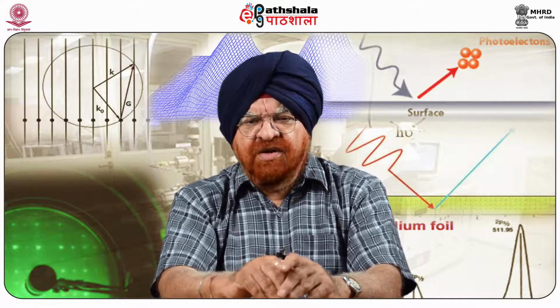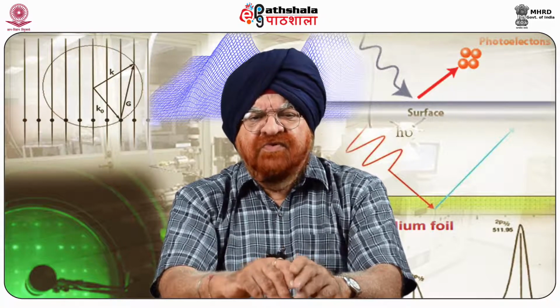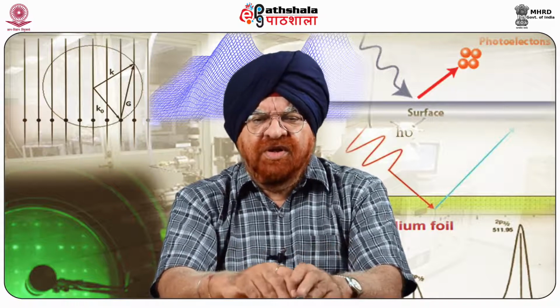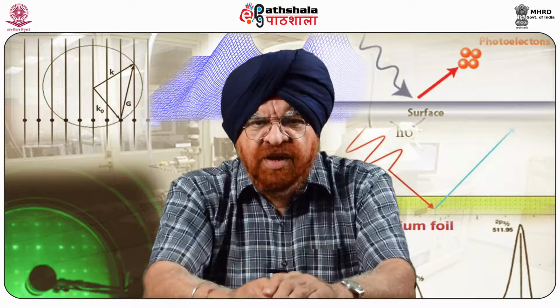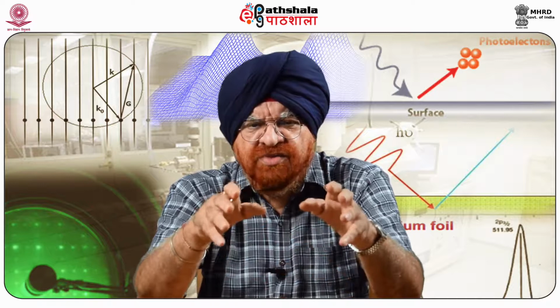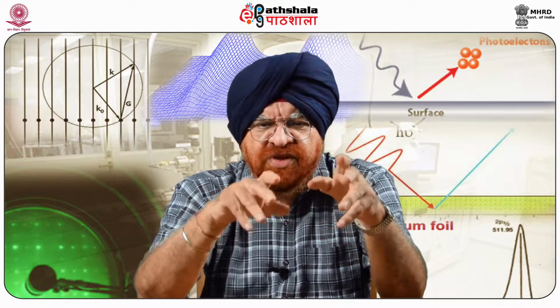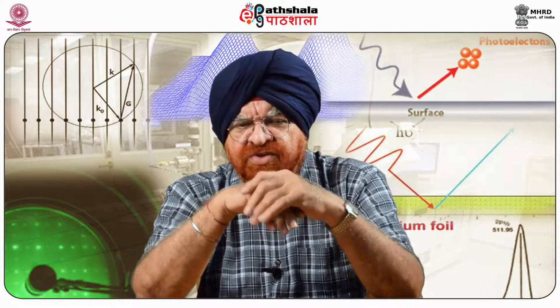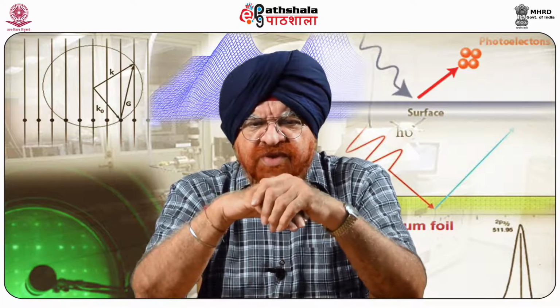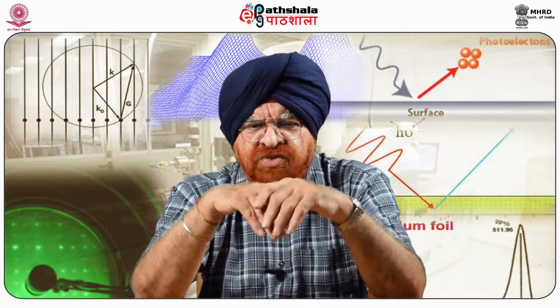The observed trend in the magnitude of the adhesive interactions between tip and sample functional groups, that is COOH, CH3 and so on, agrees very well with the qualitative expectation that the interaction between hydrogen bonding groups will be greater than between the non-hydrogen bonding groups like CH3. The forces observed in dry inert gas between these and similar functional group combinations parallel the results in ethanol solvent.